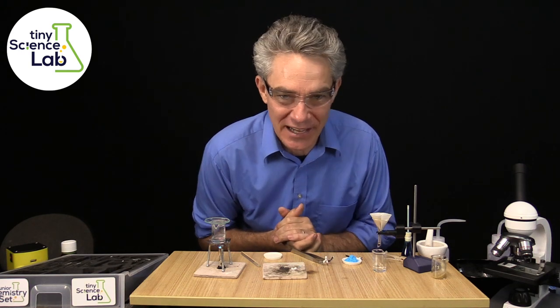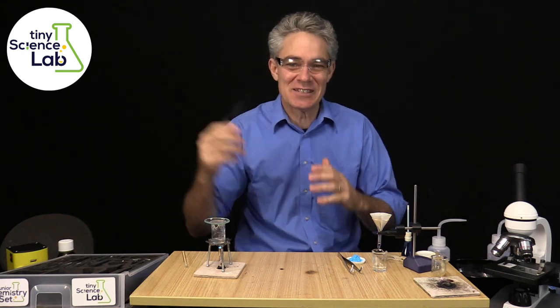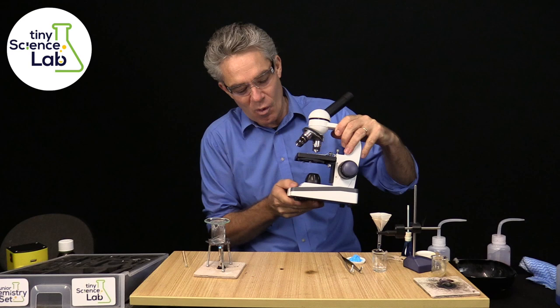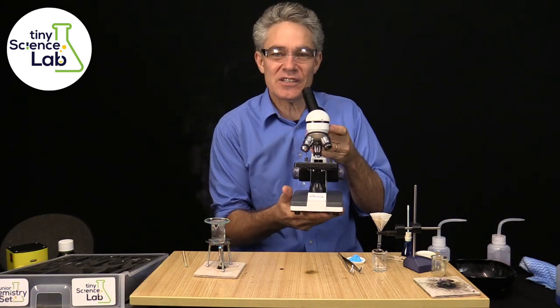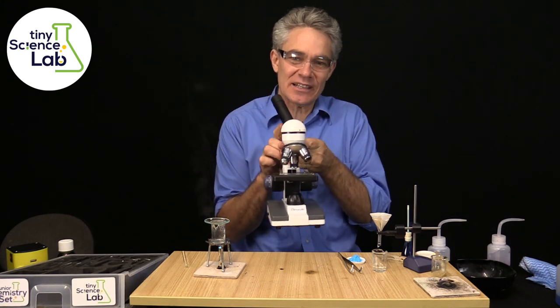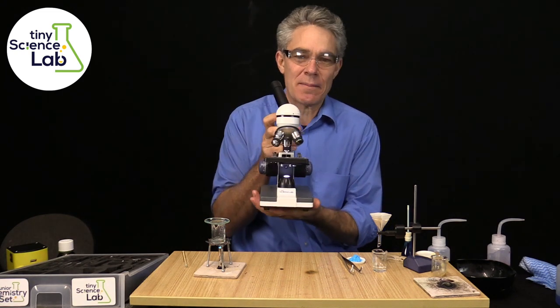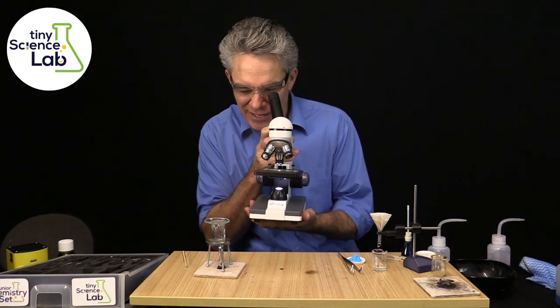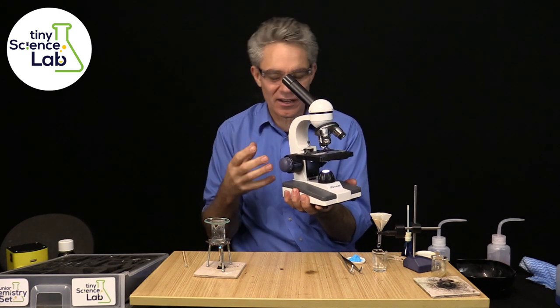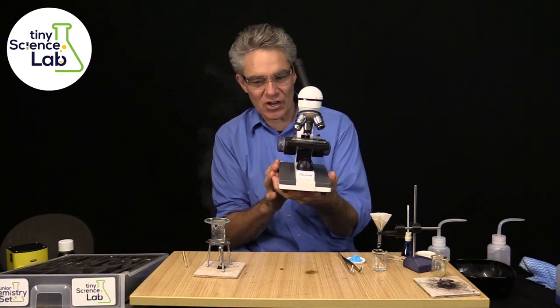I think science laboratories are going to become redundant, to be perfectly honest. Science includes earth science, physics, and biology, and so we've sourced this wonderful microscope. I've been using them with my homeschool kids — they're robust, they're high quality, and very excitingly, they have got their own power supply. They're battery operated, so you don't actually need to have electricity to run the lights to power your microscopes. You can get fantastic ones just like this.